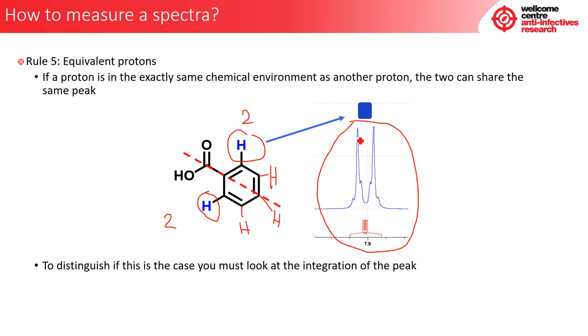This here is signifying that you have 2 peaks. So let's read off just the highest peaks for now. We will not speak about the smaller peaks just now, again beyond the scope of this NMR rules, but they will be mentioned in later tutorials. Here we can see the 2 major peaks.